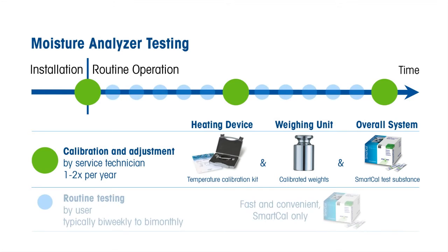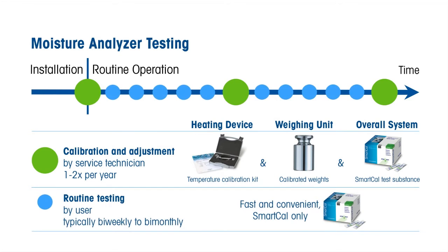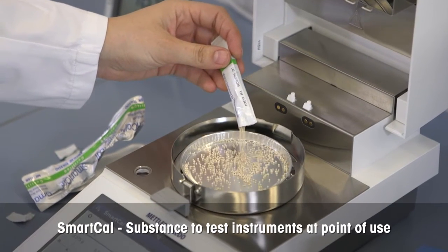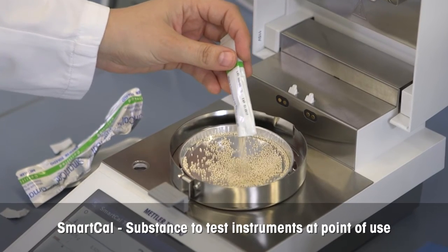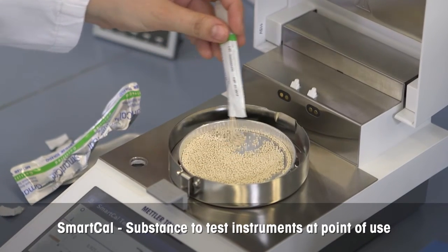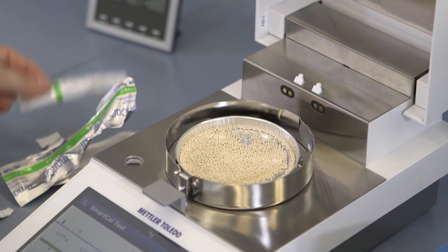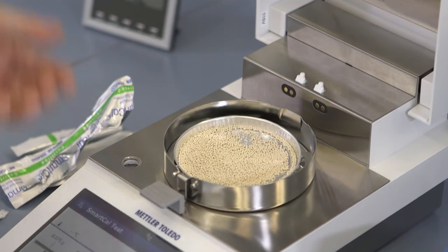It is highly recommended that the user applies SmartCal also in routine performance testing. SmartCal is a unique test substance with a known moisture content that can be used to test the overall performance of a moisture analyzer with a single standard moisture measurement that takes just 10 minutes.